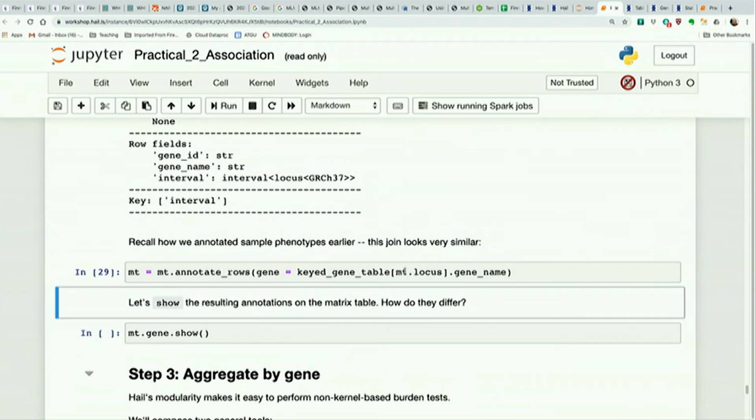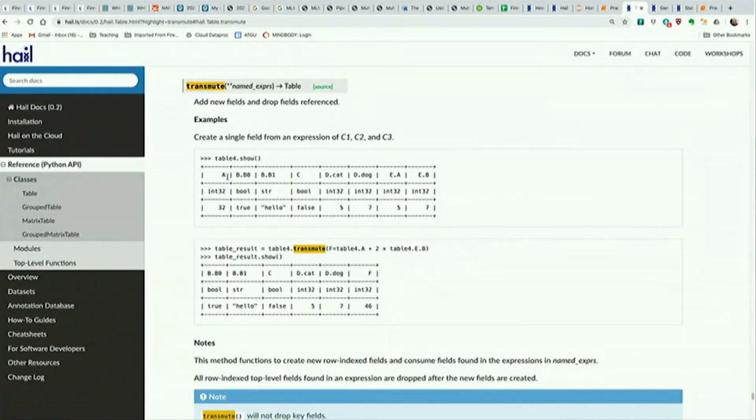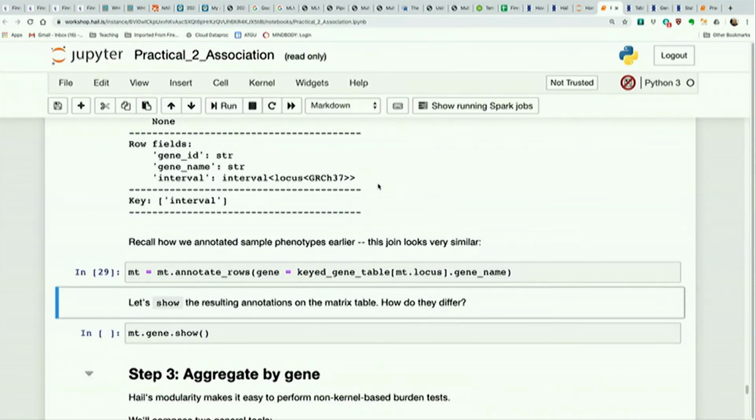I believe this will randomly pick one of them. Is that right? Yeah, there's a way to get all of them, all of the matches. There is, yeah. So this syntax just gets one of them. I think it's the join function. I won't take time to do that. But yeah, a method called join, which gives you more options for how to combine it.